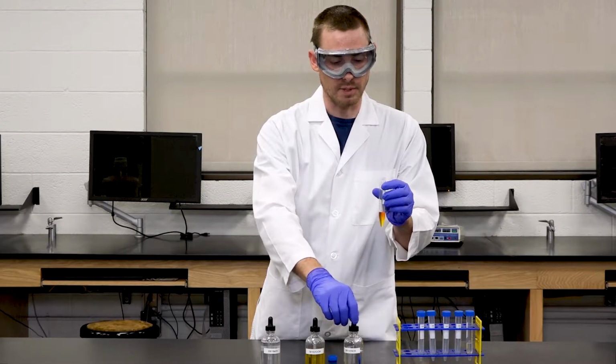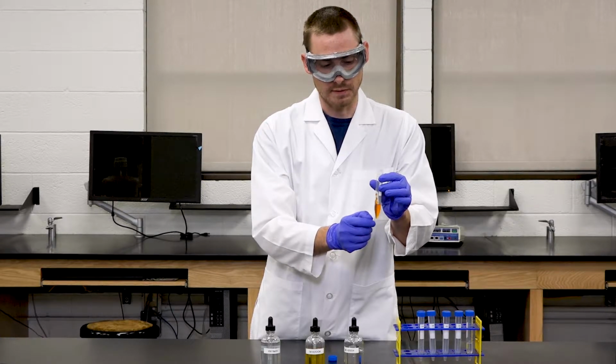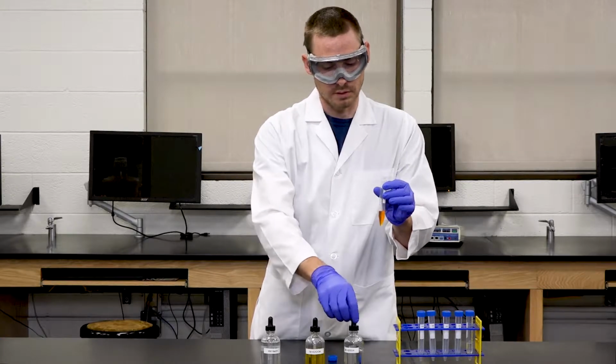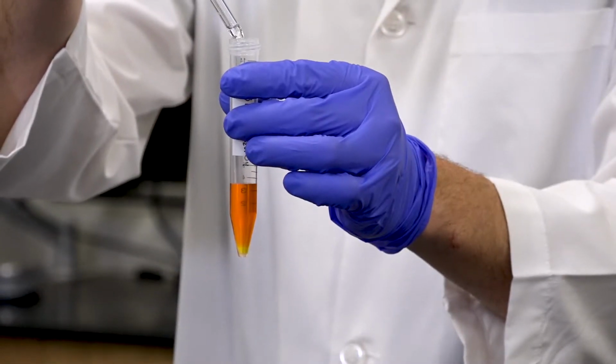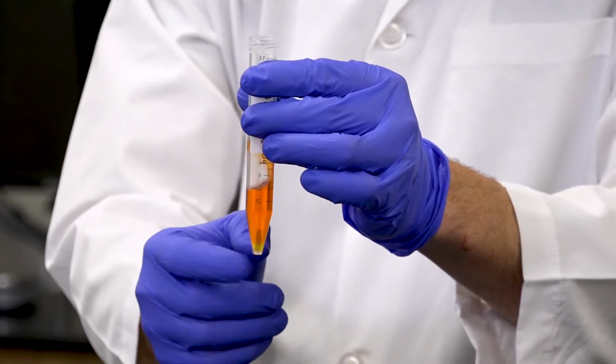This will form the dichromate ion, which is orange in color. And as you mix it, you'll see that almost all of the ions will move towards the product side. You may have to add more acid to fully consume the yellow color in the solution.